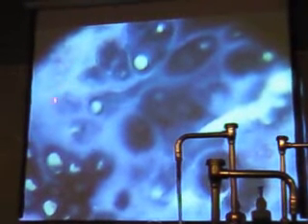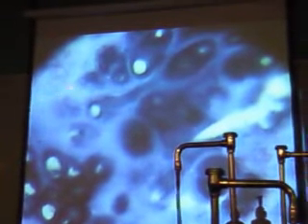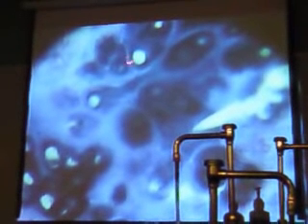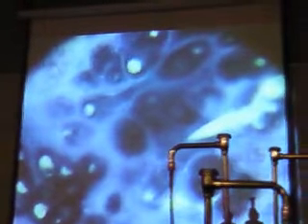Where the light blue here is what? Chondroitin. The non-living matrix is chondroitin. These open areas are lacuna. What do we find inside the lacuna? Chondrocyte. Chondrocytes.